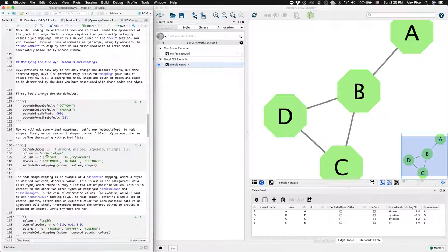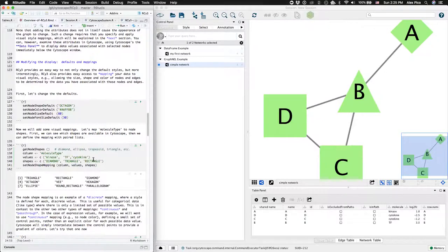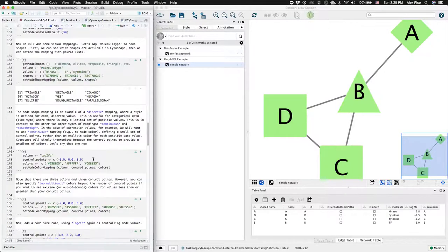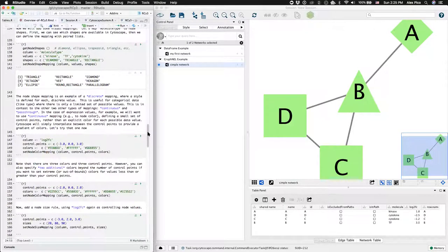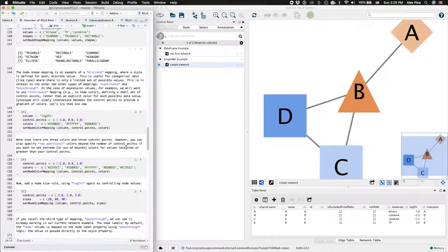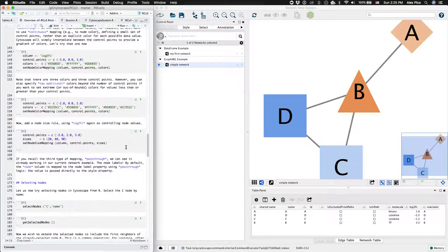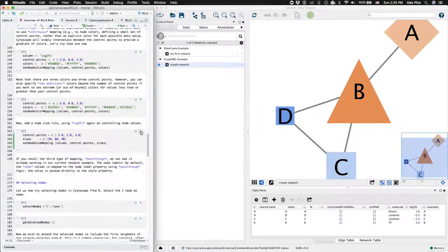You can also get information about node shapes that are available and set those. You can set node color mappings based on node attributes, and node size mappings.